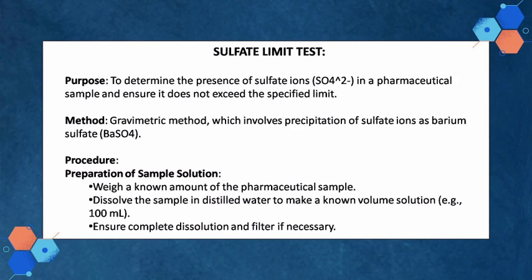The procedure for the test involves: preparation of sample solution. Weigh a known amount of the pharmaceutical sample. Dissolve the sample in distilled water to make a known volume solution, example, 100 ml. Ensure complete dissolution and filter if necessary.